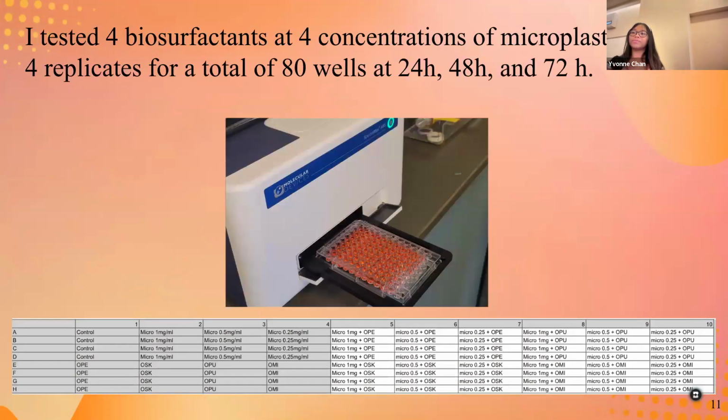For this experiment, we measured cell viability to see if the HaCaT cells were alive and working. Cell viability was tested with an XTT assay through the ELISA machine, and it counts if the cells are alive through the specific wavelength of 450 nanometers, where higher levels show higher cell viability in the graphs I'm about to show you.